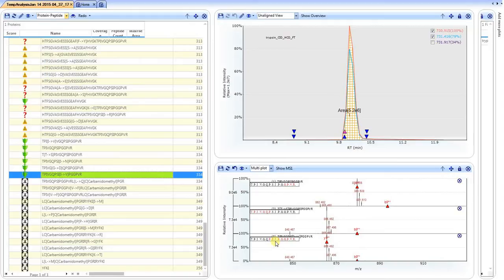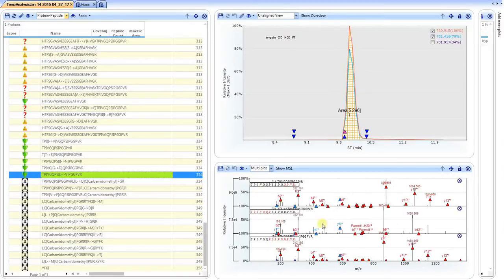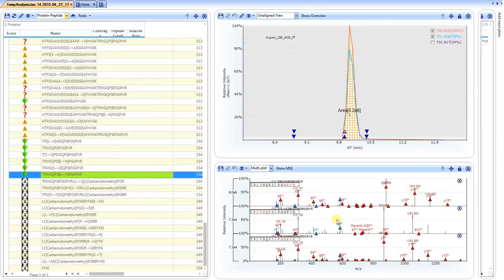We have increased confidence that this is in fact a better match than the first option, which was the threonine to serine at the N-terminus. This ends this particular video.